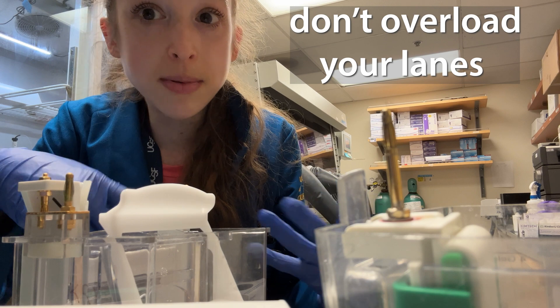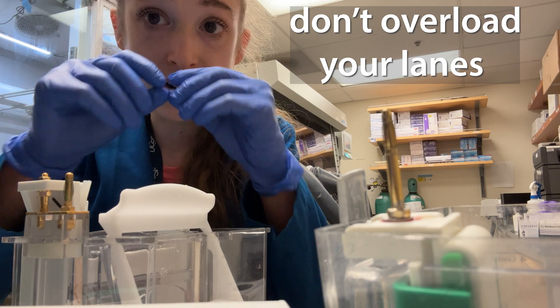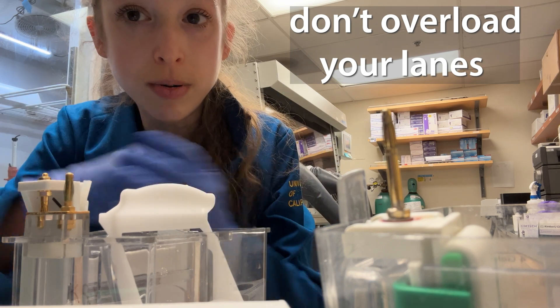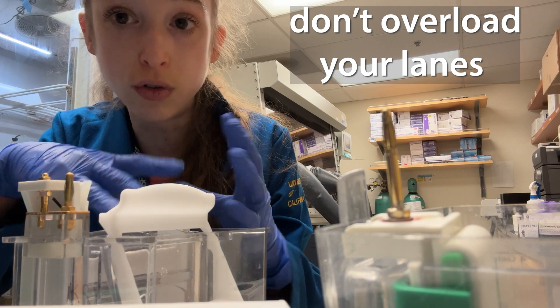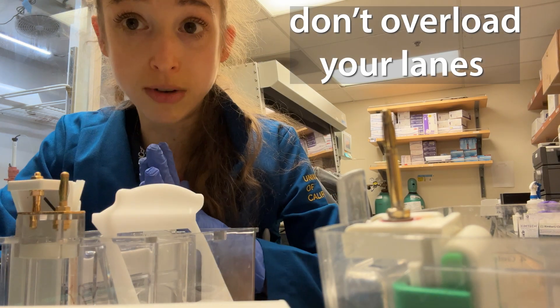One of the other problems is you might have too much sample. If you overload your sample lanes, this can cause your gel to run really weird. Typically it will vary, but if you have a pure protein you don't want to do more than about two micrograms. For something like a lysate, about 25 micrograms of total protein would be your maximum. If you have more than that, you're going to get warping of the gel run.